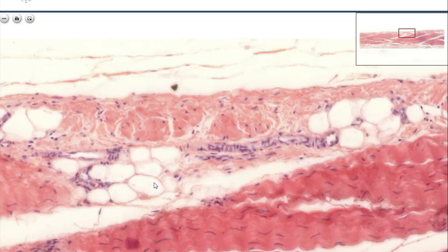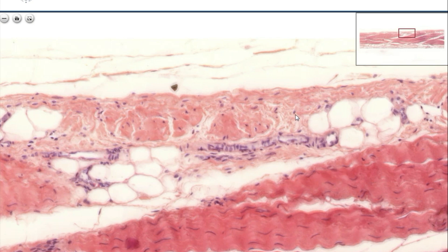On the edge of the slide, you see fat cells. These are 50 to 100 micrometers in diameter. You also see some looser connective tissue. There is a very wide transition because the extremely loose connective tissue, the denser loose connective tissue, the looser dense connective tissue, and so on — this is a stepwise transition. There are no definite lines between these categories.